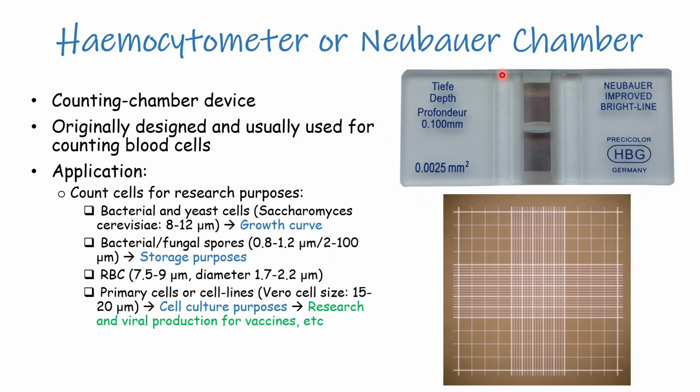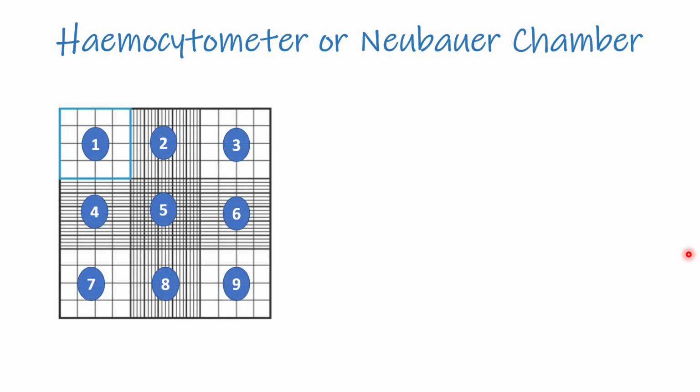And so we can see here that this is the tool, right? If you focus right above here, the part I'm highlighting, you can see a very faint square. That's the grid, and this is how the grid looks under the microscope. And these lines are made by special lasers, okay? Now, each grid has 9 big cells. 1, 2, 3, 4, 5, 6, 7, 8, 9.